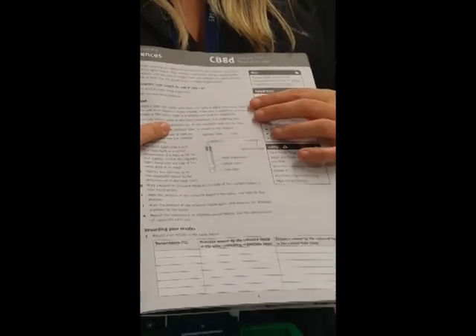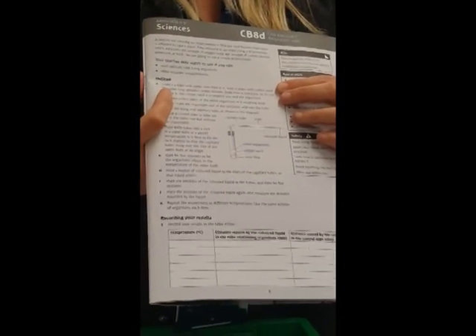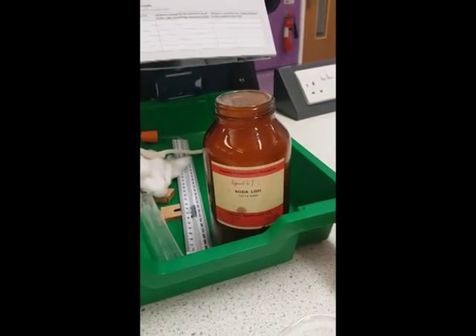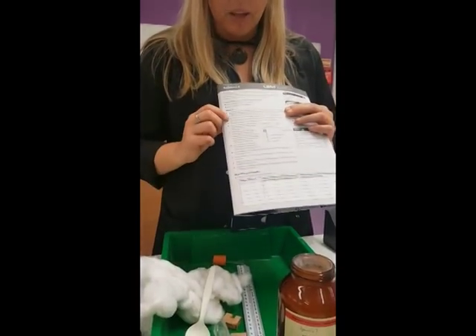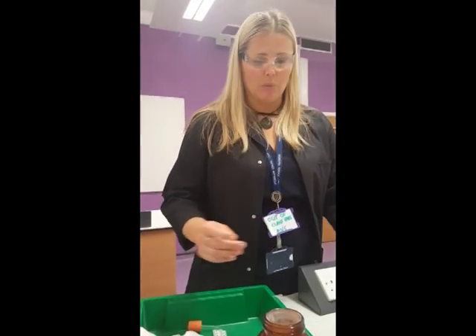Our first step is collecting a tube with some soda lime in it, held in place with some cotton wool. The soda lime absorbs carbon dioxide from our boiling tube, which will hold our organisms. You need to know that soda lime is also corrosive, so you can't handle it with your fingers — use a spoon or spatula to move it. The cotton wool is there to protect the organisms from touching the soda lime, which would be disastrous for them.